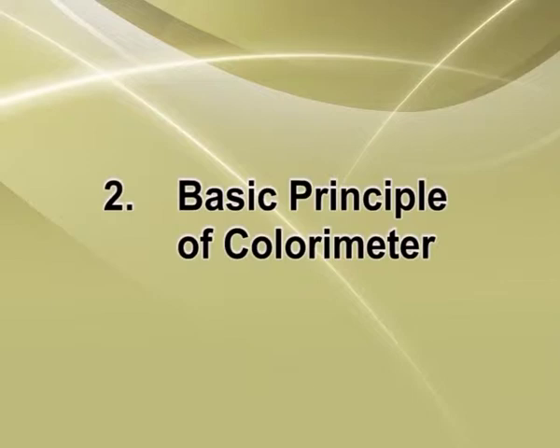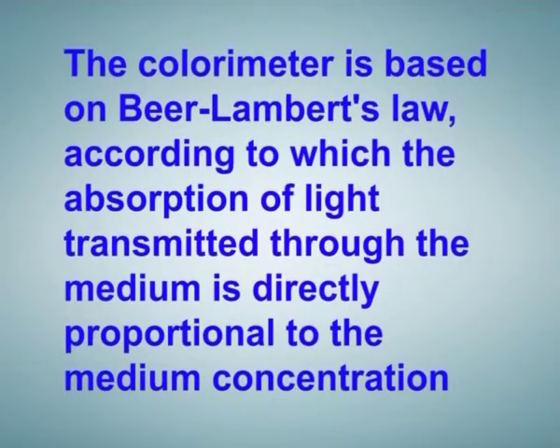Let us see the basic principle of colorimeter. The colorimeter is based on the Beer-Lambert's law, according to which the absorption of light transmitted through the medium is directly proportional to the medium concentration.